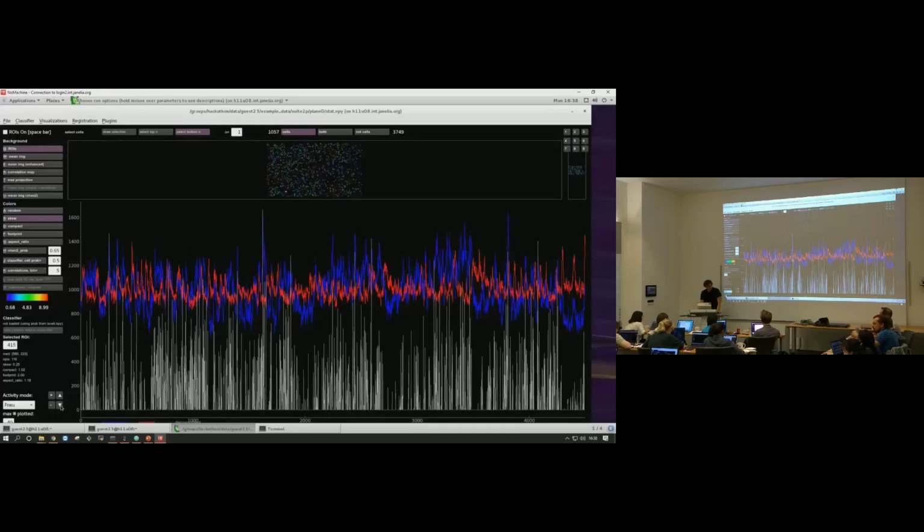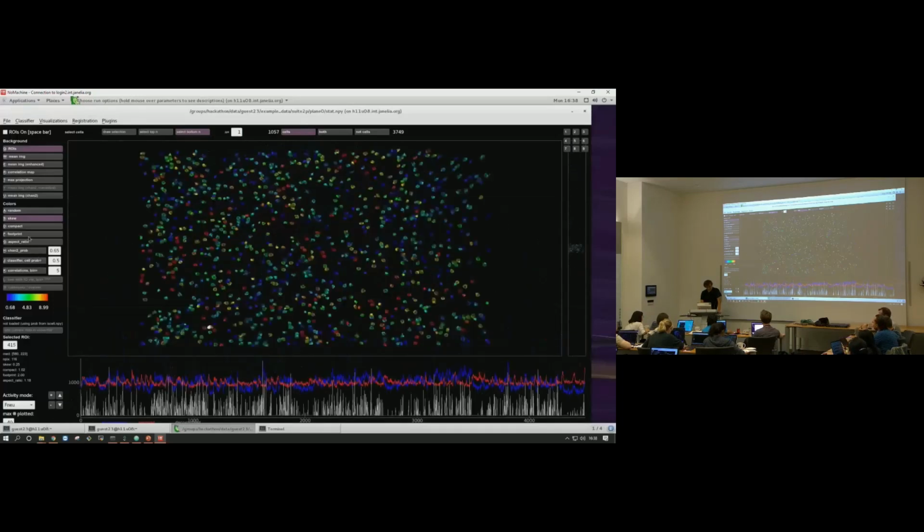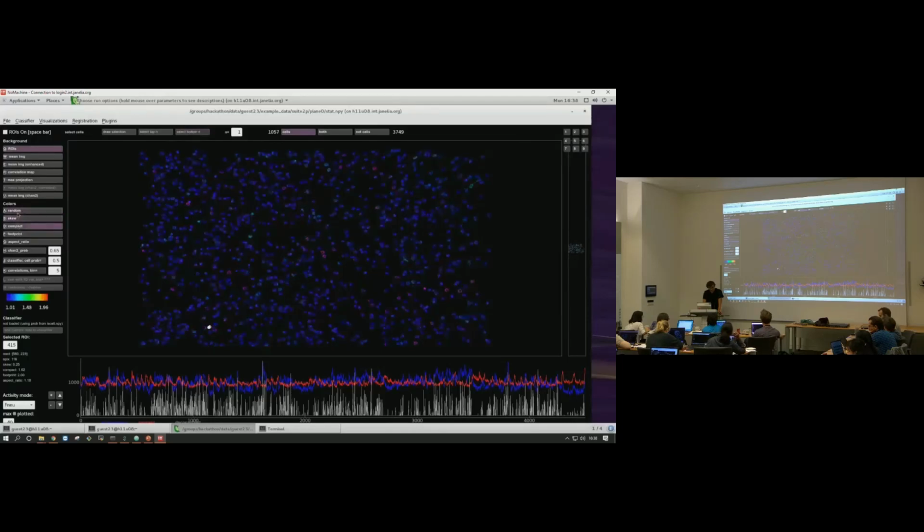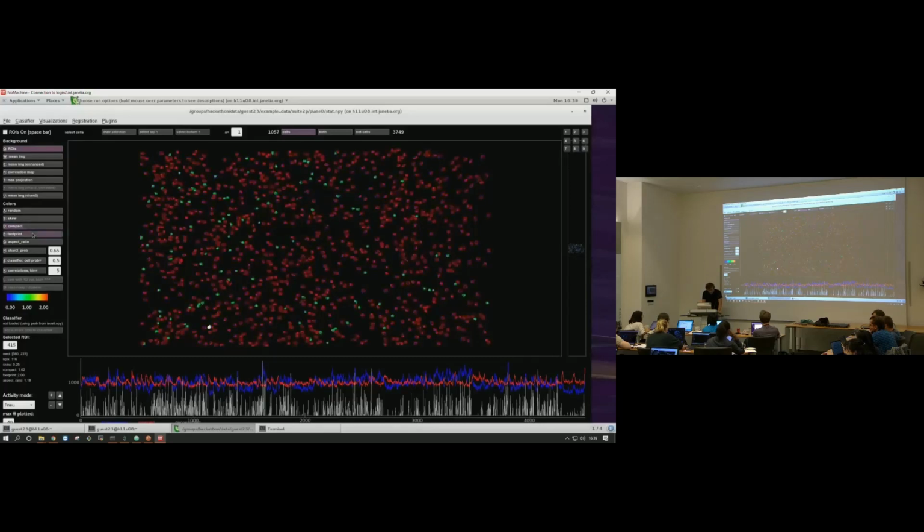All right, any more questions about this view? So yeah, with the GUI, I don't know if we really gave you a GUI tutorial, but these colors, just briefly, you can switch between random, skewness, compactness. So skew, compact, footprint are the same things printed down here. And then you can color the whole field of view with them. Footprint is pretty useful.